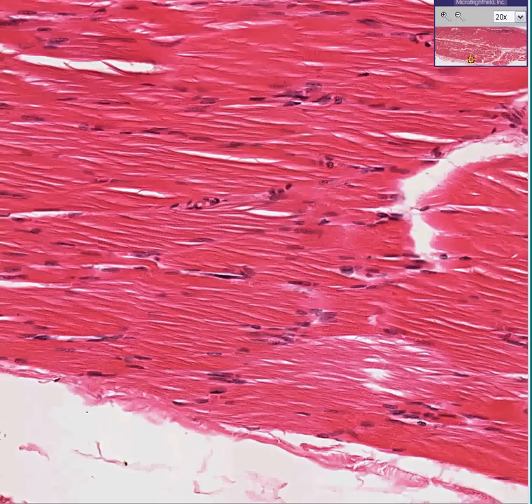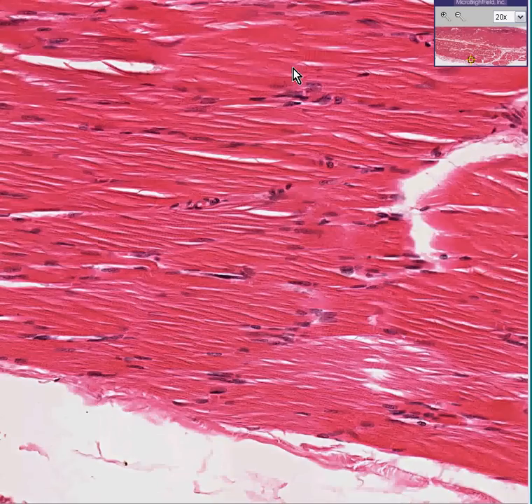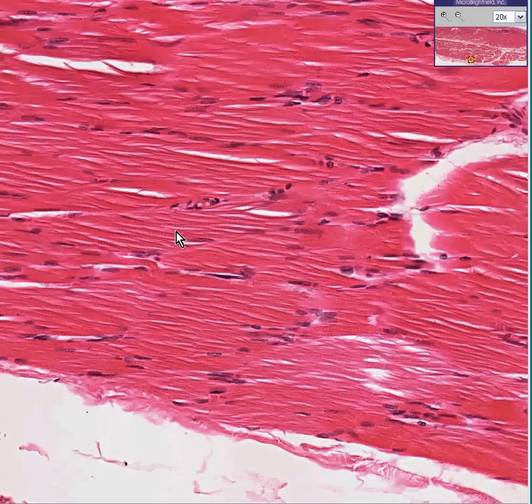This case will be called part one of poliomyelitis. You could instantly recognize this tissue as being striated voluntary skeletal muscle because you could see striations here, and in general the fibers are just kind of laying on top of each other like stacked logs, and the nuclei are at the periphery.